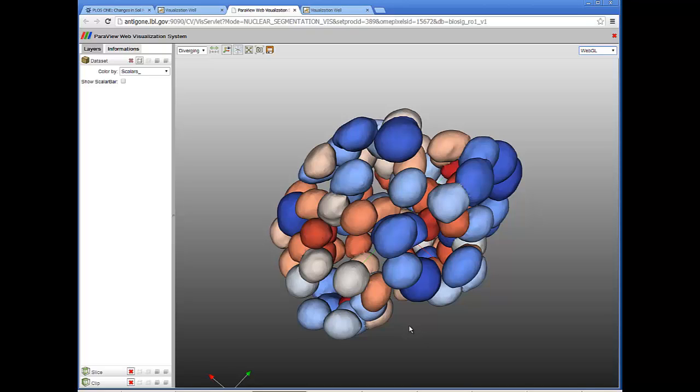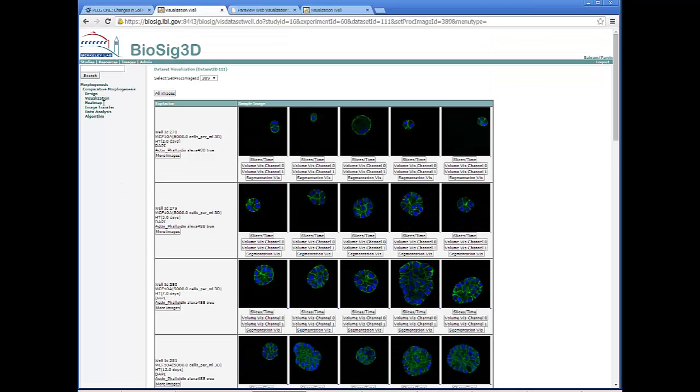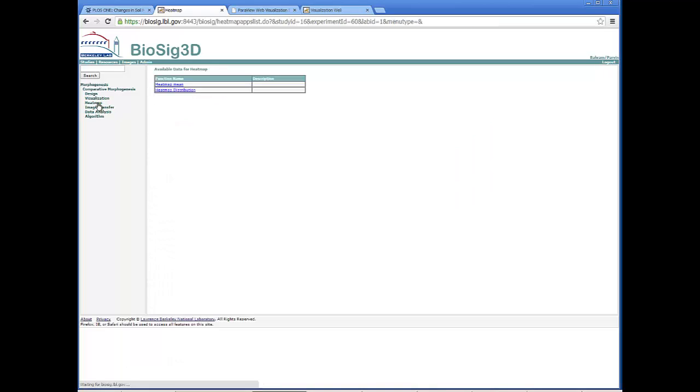So as a result of this operation, nuclear morphometry is computed. Molecular endpoint for each nucleus is also computed if the samples are stained, and colony organizational features are also computed. We can then proceed with bioinformatics analysis. We support two different policies in terms of mean analysis or distribution analysis.